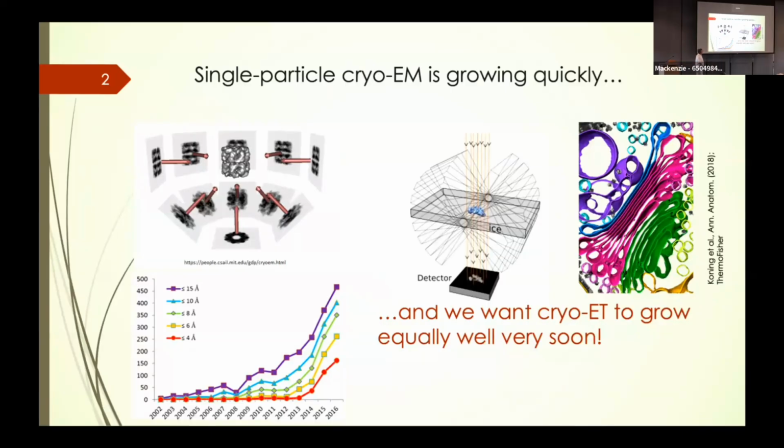The method is that a cryo-EM specimen contains purified proteins, hundreds and thousands of them in a single image. They all have different orientations. The computer can put the images taken from different orientations together and yield a 3D reconstruction by the Fourier slice theorem, okay? But this works only for single molecules of which you can have lots in a single image. How about seeing these molecules in the biological context? Well, there's an answer to that too.